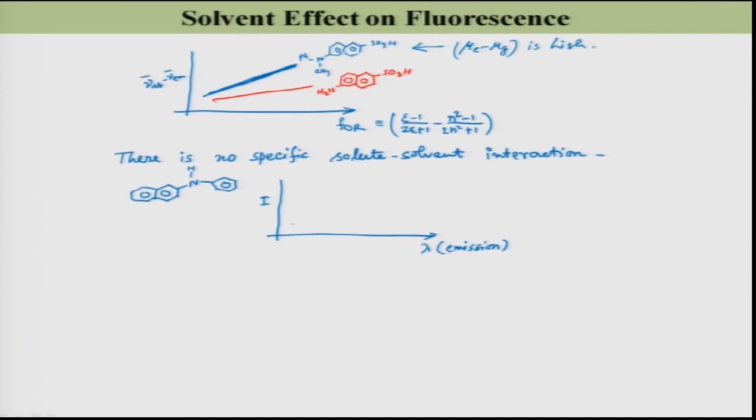So, when it is pure water, this emission is something like this. This maximum is around 400 nanometer, here is around 450 nanometer.